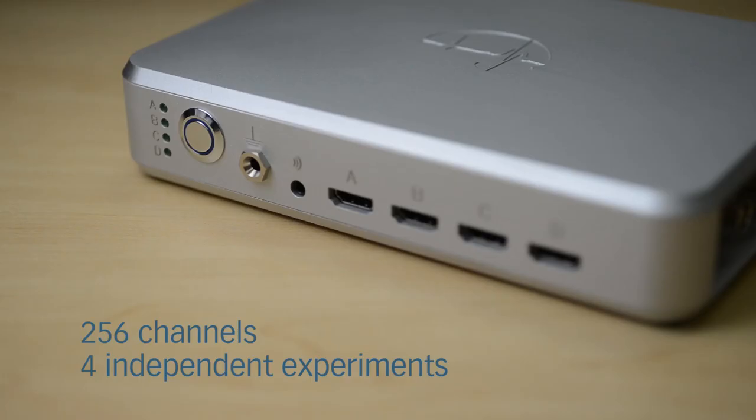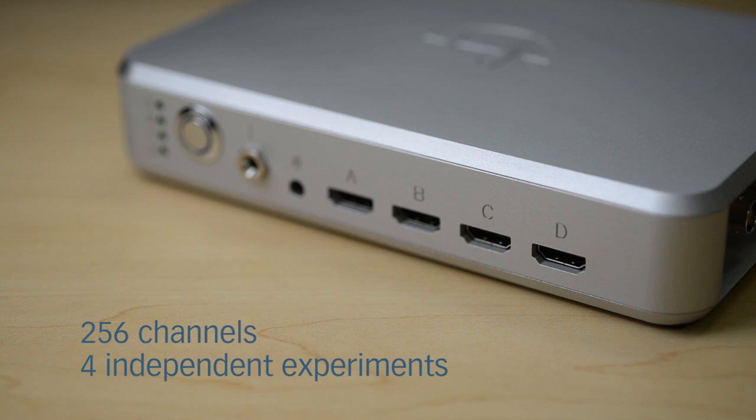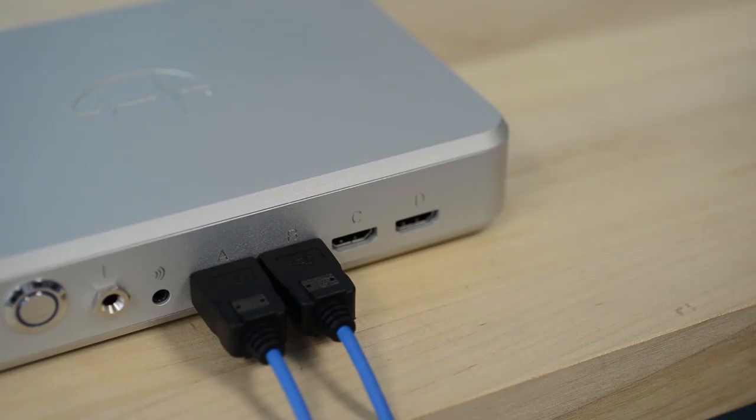The SmartBox is capable of recording up to 256 channels of biological signals simultaneously from up to four independent experiments.